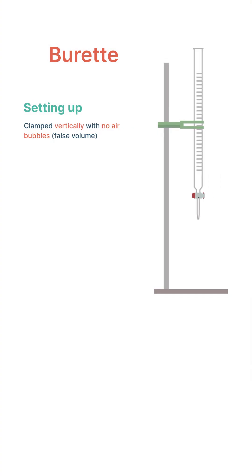In setting up the burette, it should be clamped vertically, and throughout its use we should always be checking that there are no air bubbles present, as this would give a false volume.